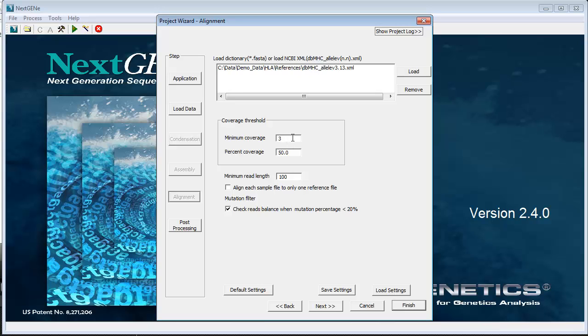Minimum coverage is the minimum number of reads required to be matched to an allele for the allele to be reported.